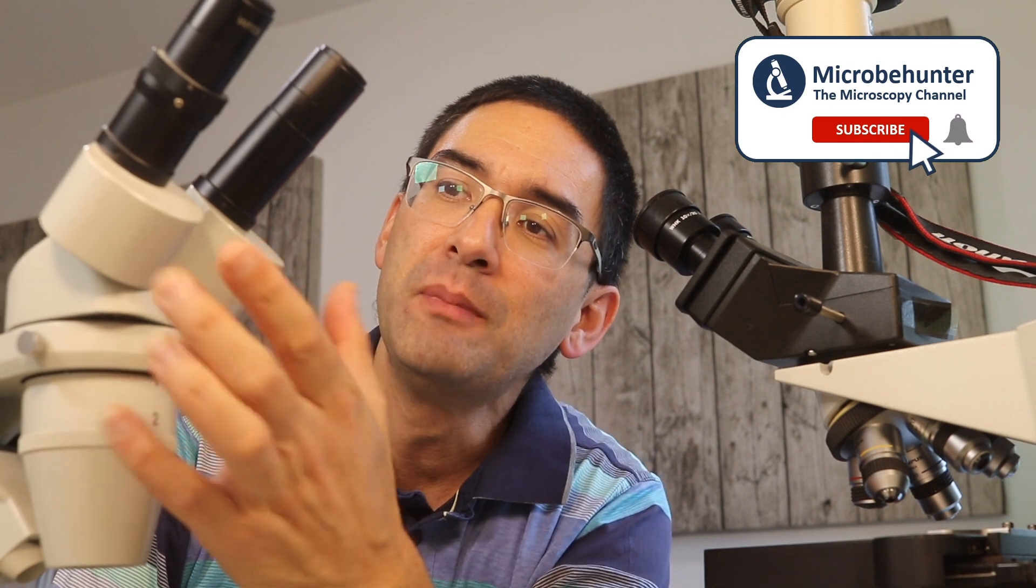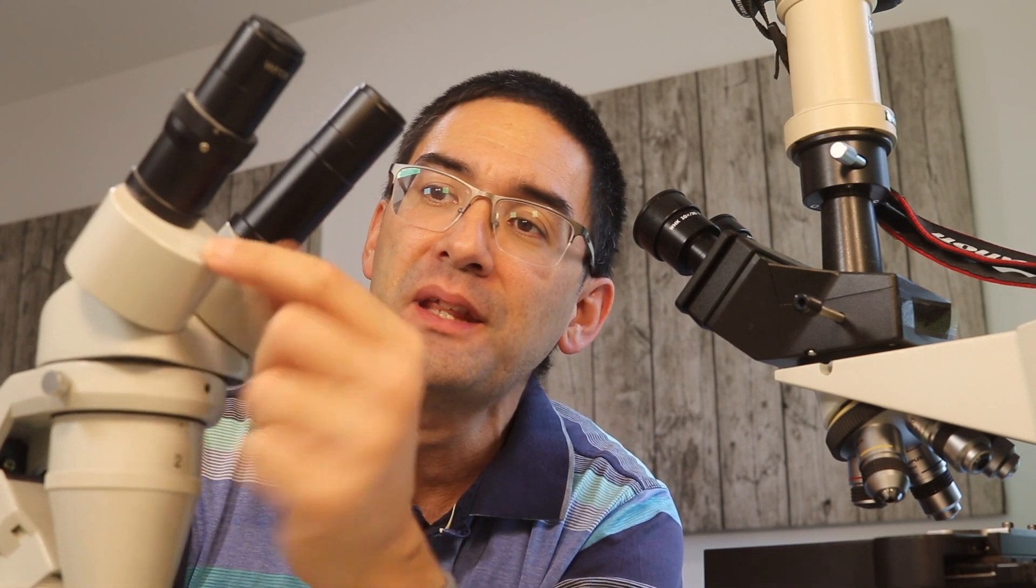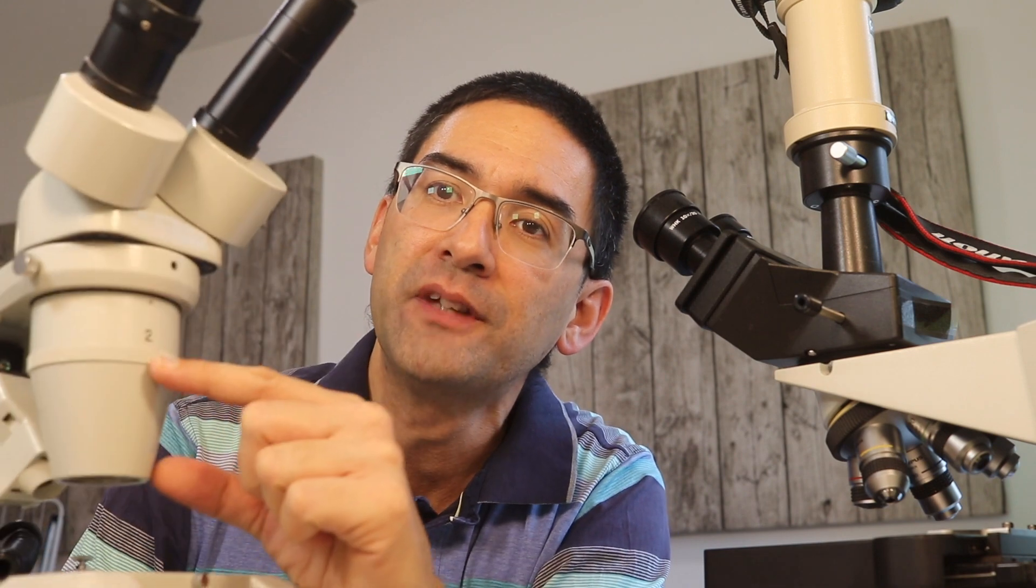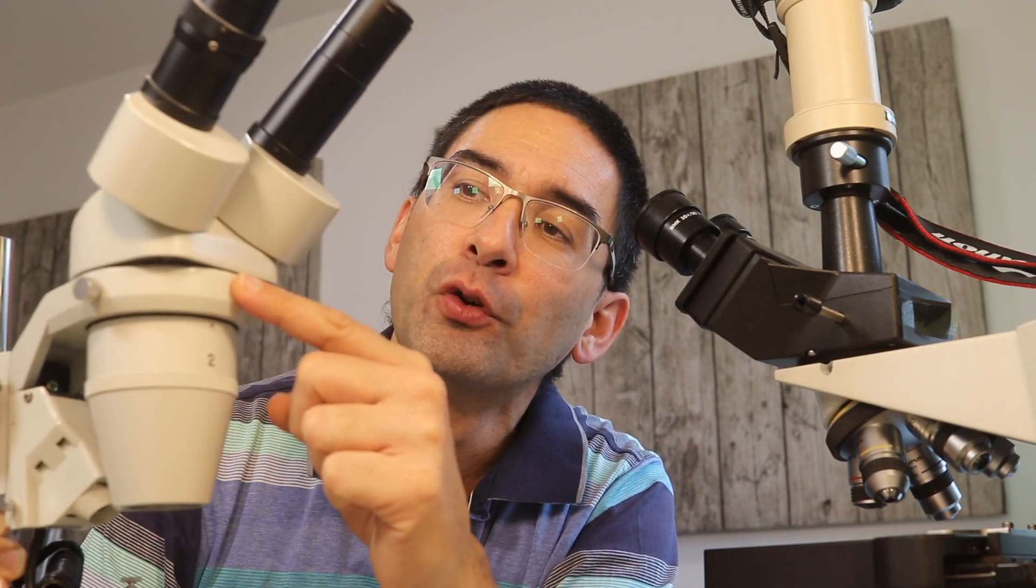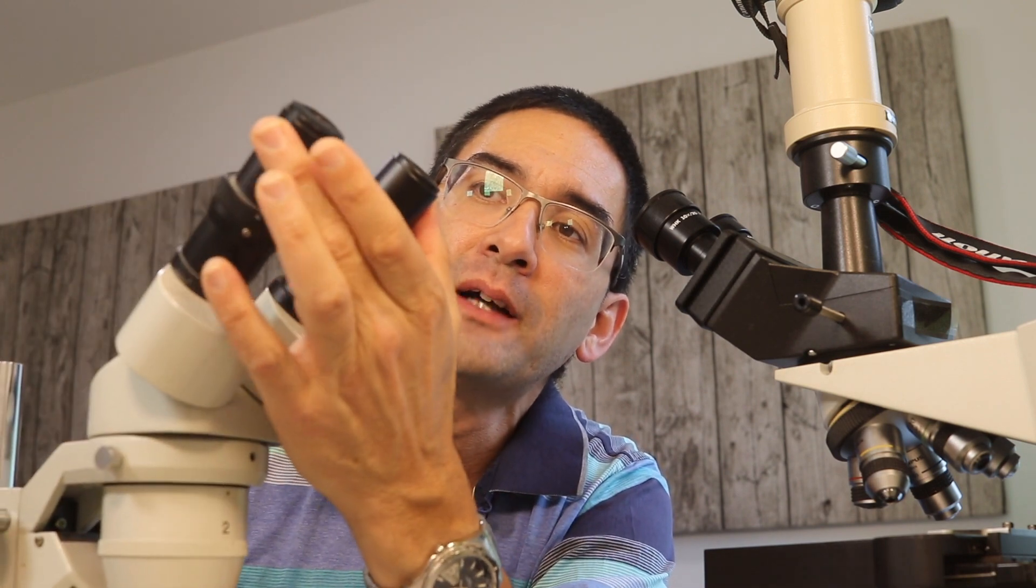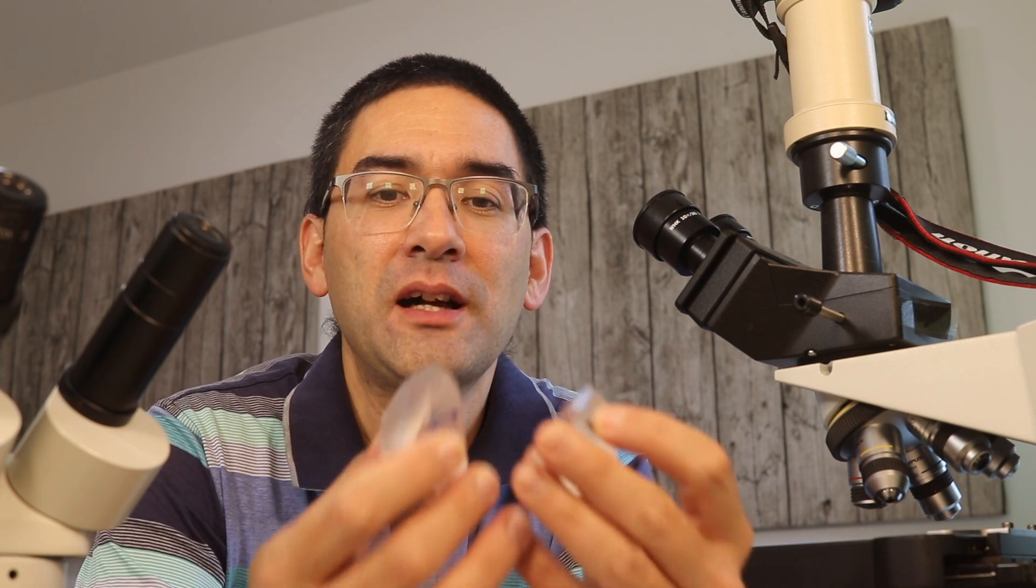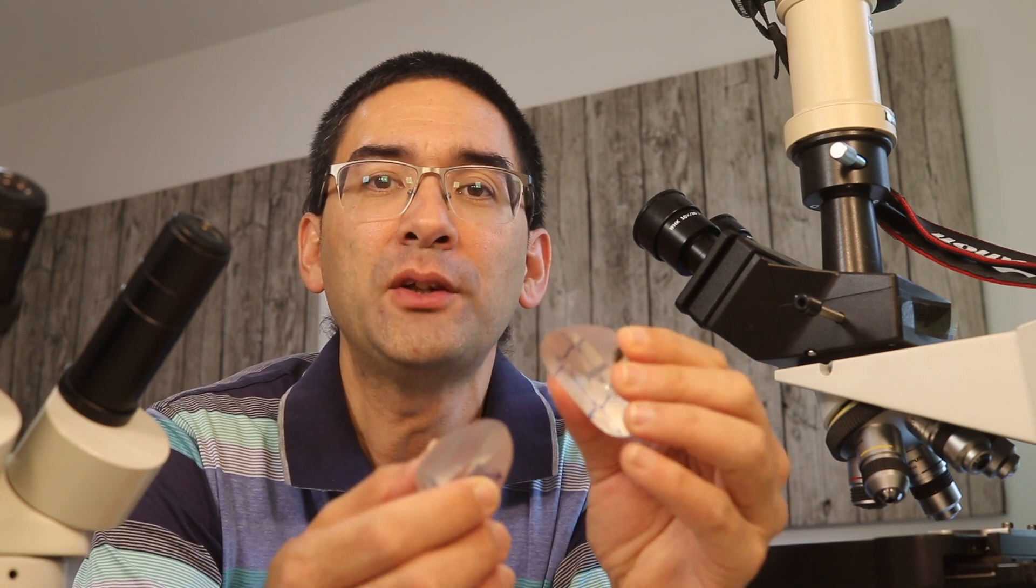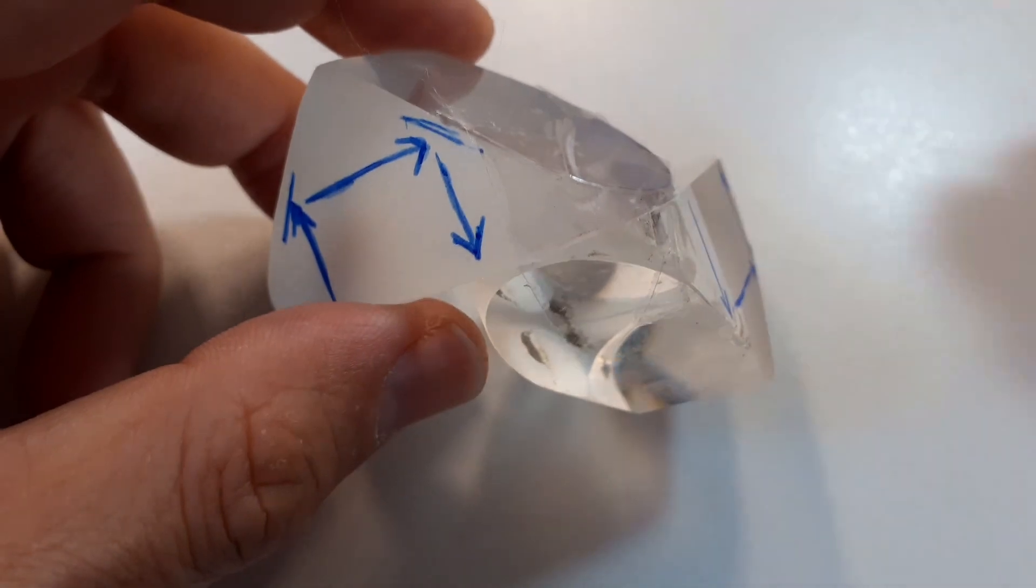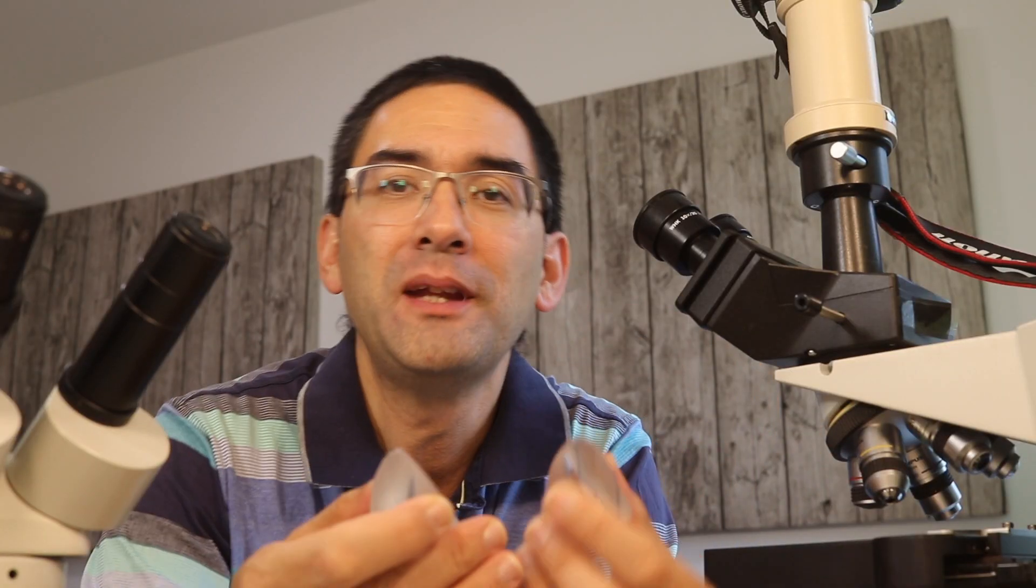And the reason is because in here you have an optical system prisms that flip the image around. So the objective down here produces an inverted image which is then flipped around here upright and then it's further magnified by the eyepieces. And the question that I want to answer in this video is why do they use prisms and why don't they use mirrors?